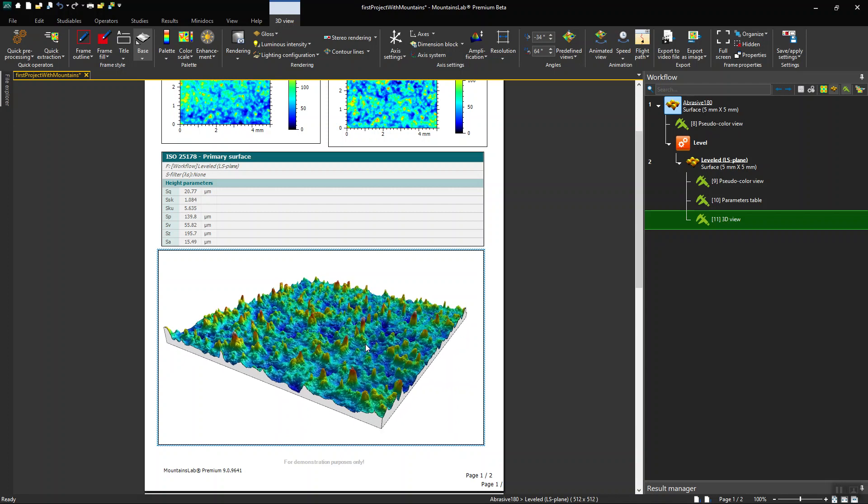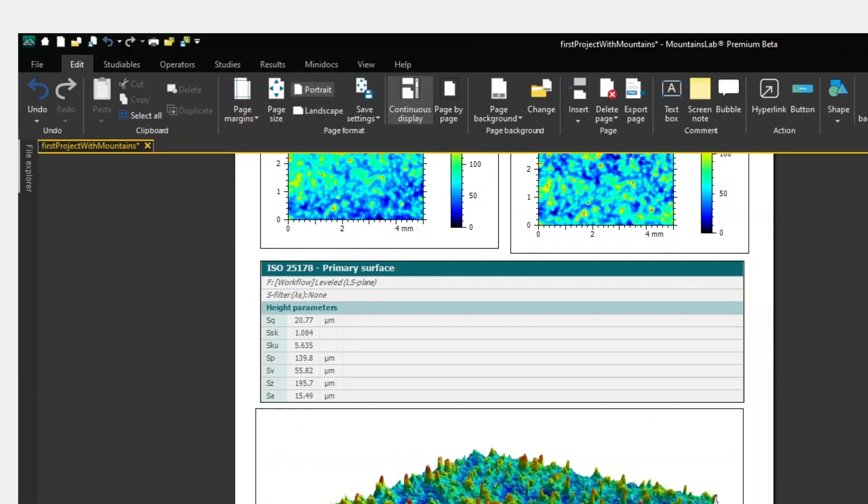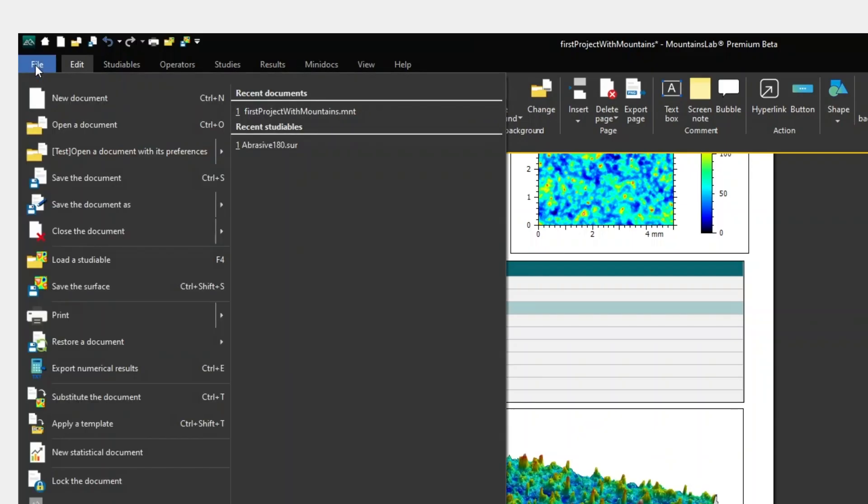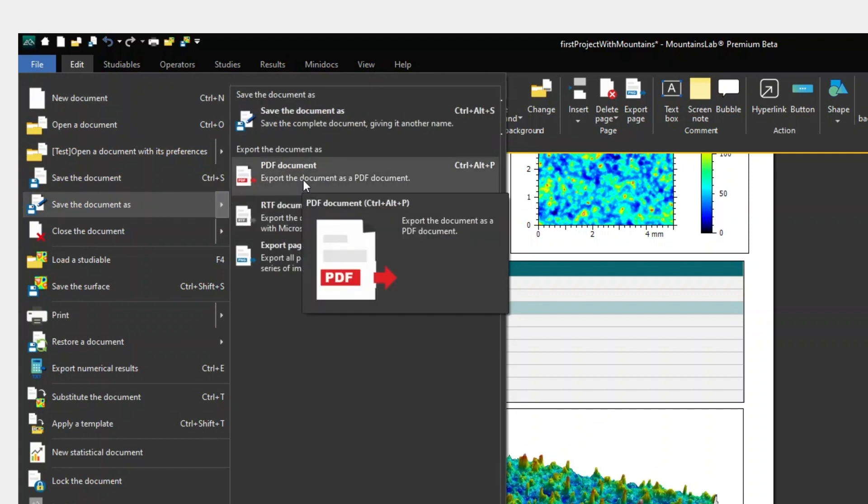Now that I'm done, I can export my document as a PDF file. To do this, click on File, then save the document as, and PDF document.